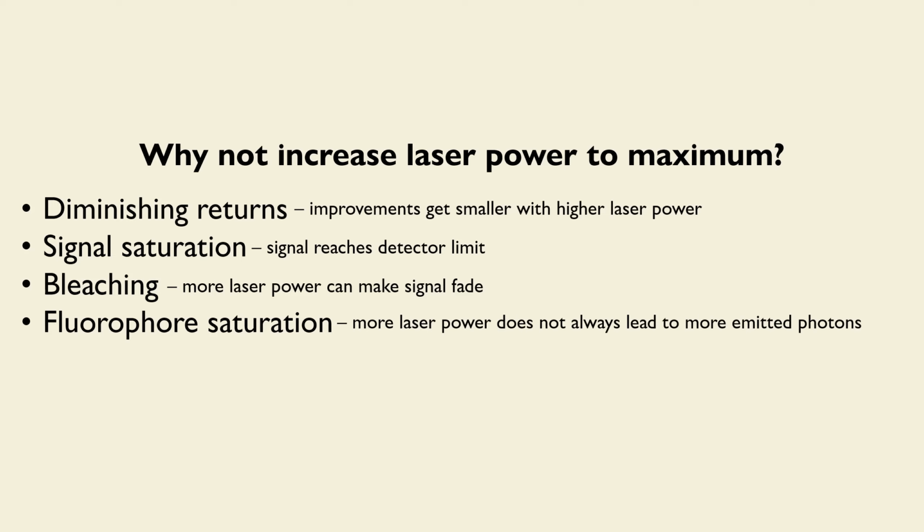Finally, there's a phenomenon called fluorophore saturation, which is that more laser power does not always lead to more emitted photons. And the reason is at a certain point, you're exciting every molecule in the sample into the excited state. They're decaying and emitting photons, and you keep repeating this over and over. So putting in more light actually doesn't do anything for you. It does not lead to more emitted photons. And so what you want are emitted photons to improve your signal to noise. If you're not getting any, there's no point in increasing the laser power if you've reached that point.